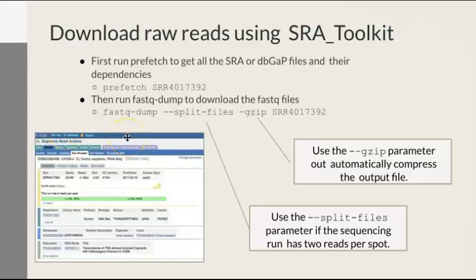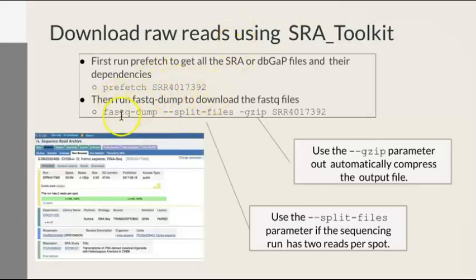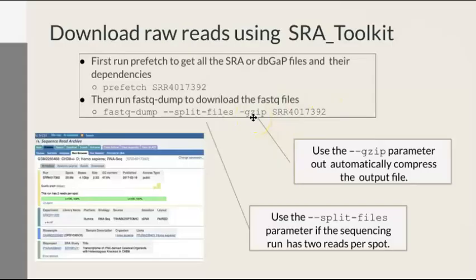If you do have access to a server, you could then use, for example, fetch. You can use this line right here on your terminal where you do a fastq-dump, and it will download the compressed zip file for you for this study, this SRR, for example. Then from there, you can have it on your machine or in your directory in your terminal, and you can start processing it more.